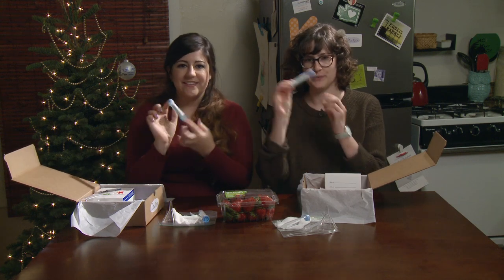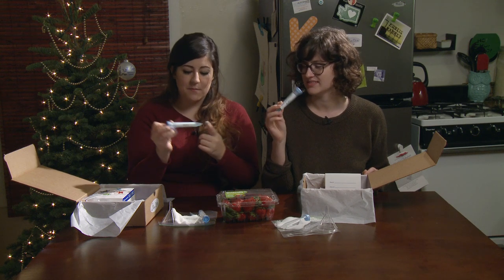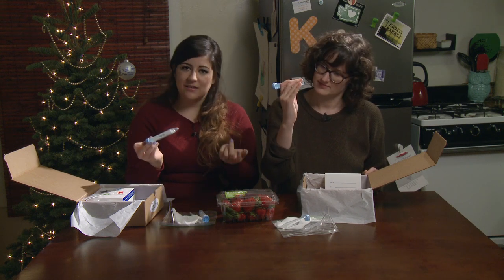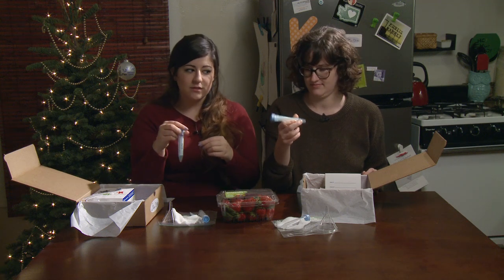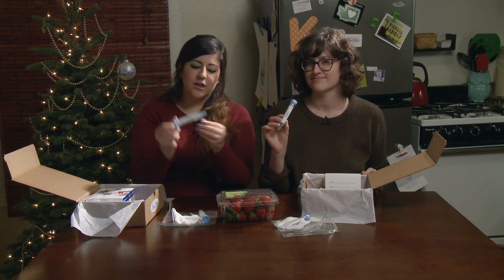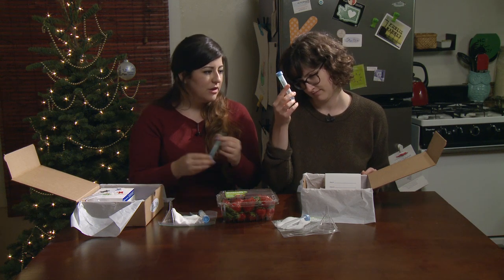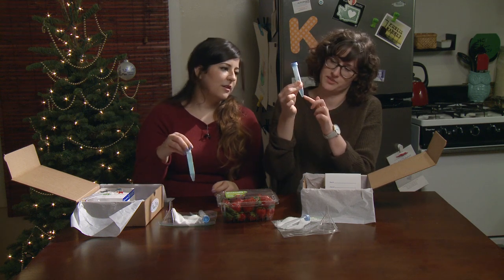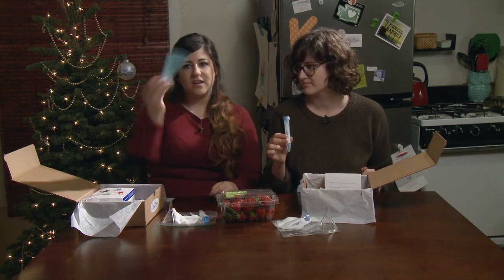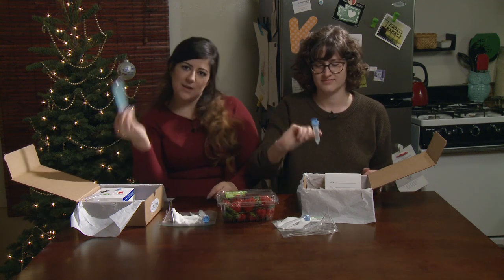DNA extraction buffer — this is the magic. What's in here is about a teaspoon of Dawn dish soap, some salt, and water. You're gonna see some white precipitate at the bottom of your tube — that's just the salt mixture. To fix that, you just invert it a few times and it should go away.